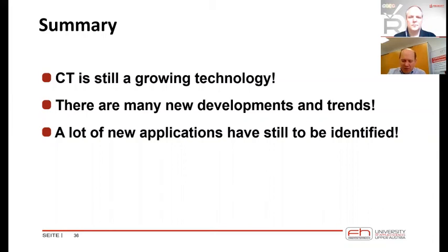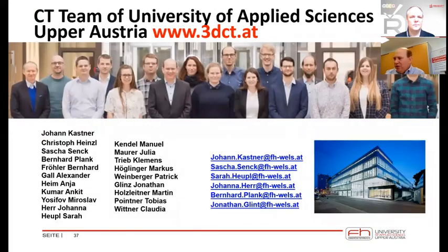And the new developments that I have shown to you: quantitative CT, high resolution CT, in situ CT, so the investigation of a process by CT, phase contrast methods, where you can measure not only absorption, but also refraction and scattering, and immersive analytics methods in connection with CT data that give additional trends and additional force to new applications. Here's a picture of the CT cube.